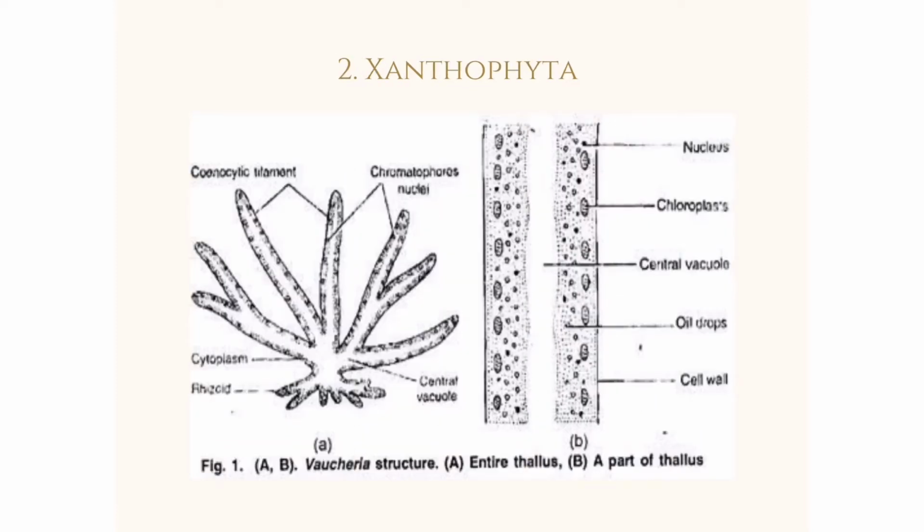Xanthophyta. Xanthophyta are yellow-green algae that live in fresh water. They may be unicellular in morphology or colonial algae, bunched together. Color is derived from green, yellow, and orange pigments involved in photosynthesis. Flagella make this type of algae motile in water.